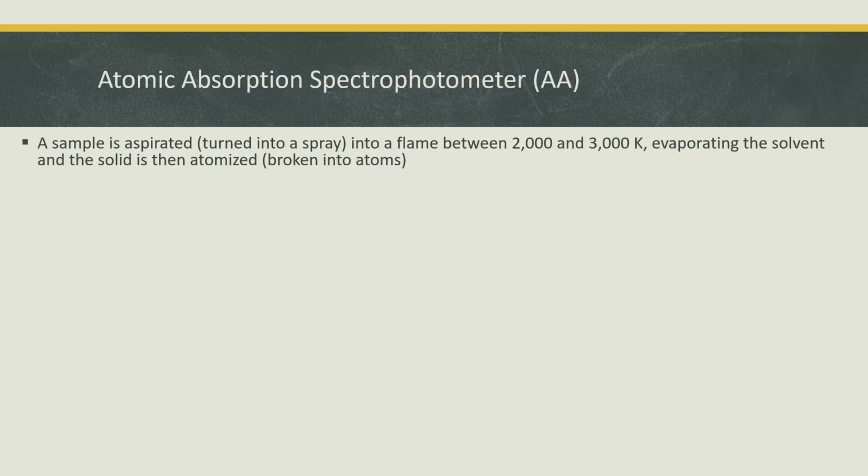So for us, we're going to be measuring magnesium. Okay. Well, if the magnesium was in the formula magnesium nitrate, well, put it in the flame, and what happens is it separates the magnesium from the nitrate and then takes that magnesium and excites it. And so it breaks into the atoms, and then it does the whole light thing that we need to happen.